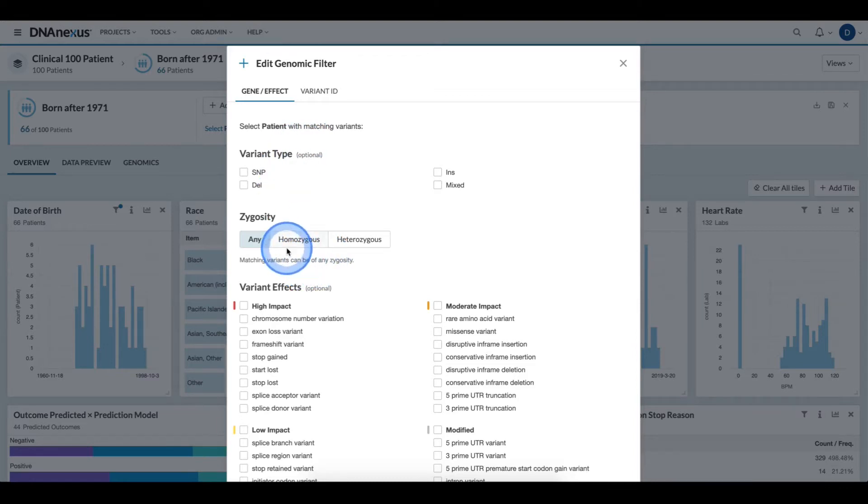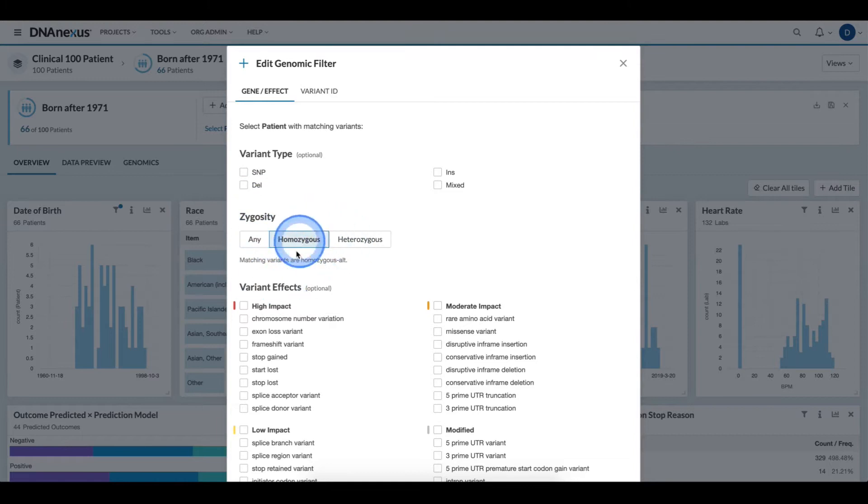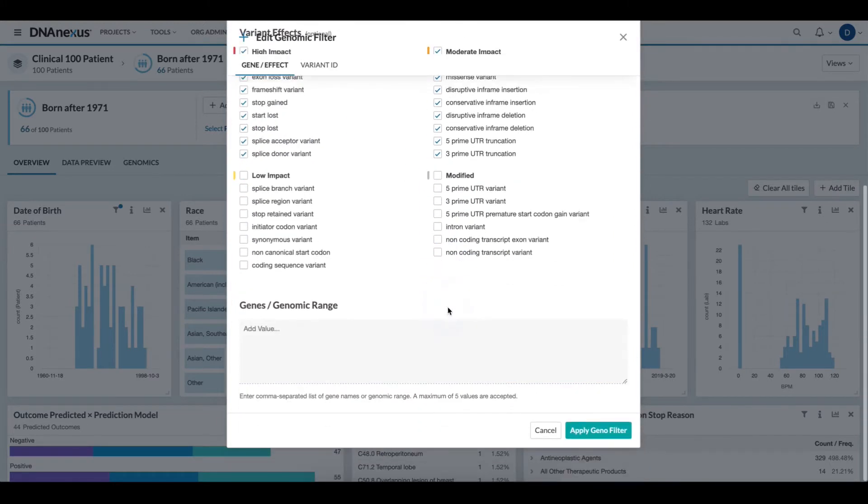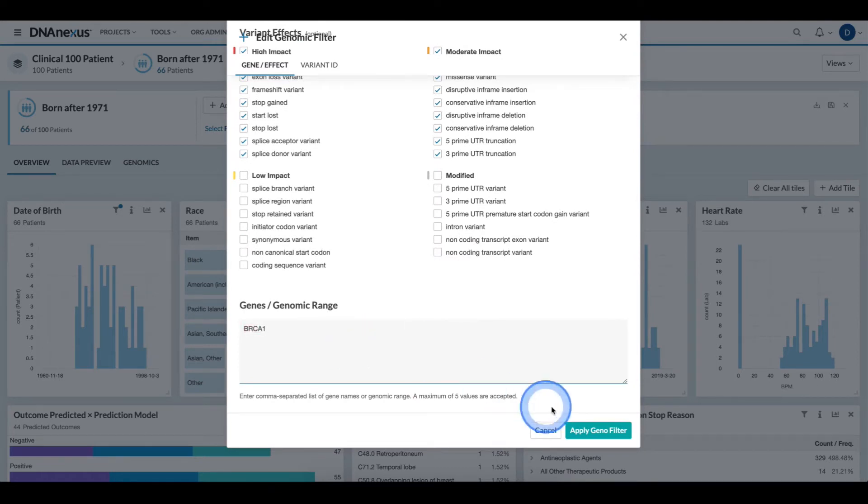To do this, in the zygosity section, I click the Homozygous tab, I select the various variant effects, and I can type in my specific gene.